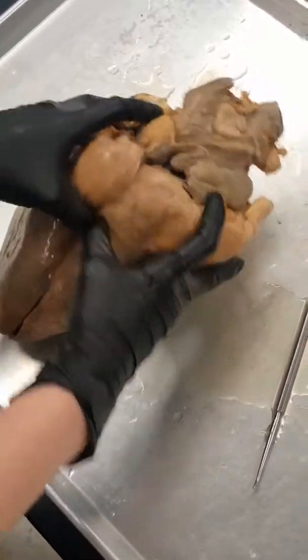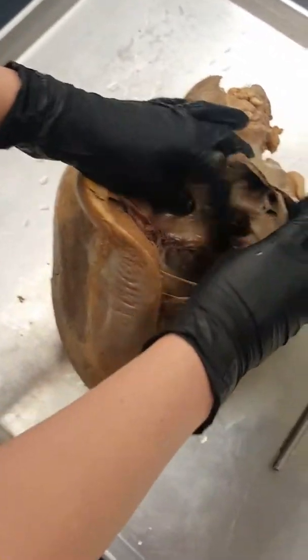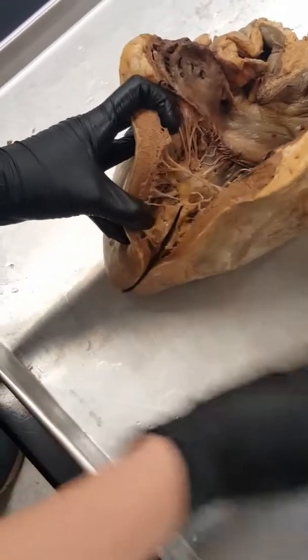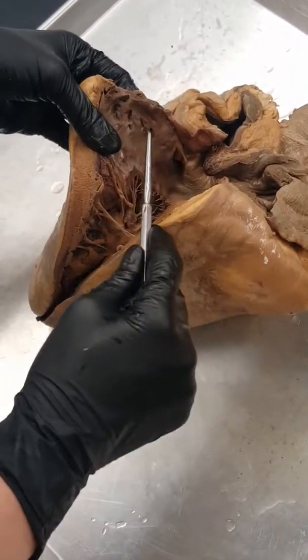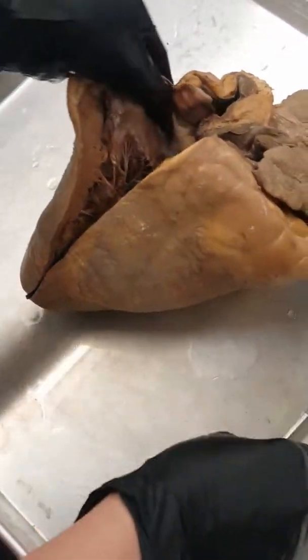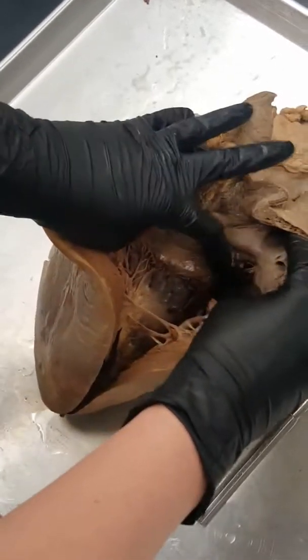Right up here, these flaps that you're seeing are going to be the bicuspid valves. These valves basically keep the blood flowing in one direction so it's not just going in and out wherever it wants to. The pulmonary vein is going to come down in here into our left atrium, and again we have our valves which just open and close — they're like little flaps.